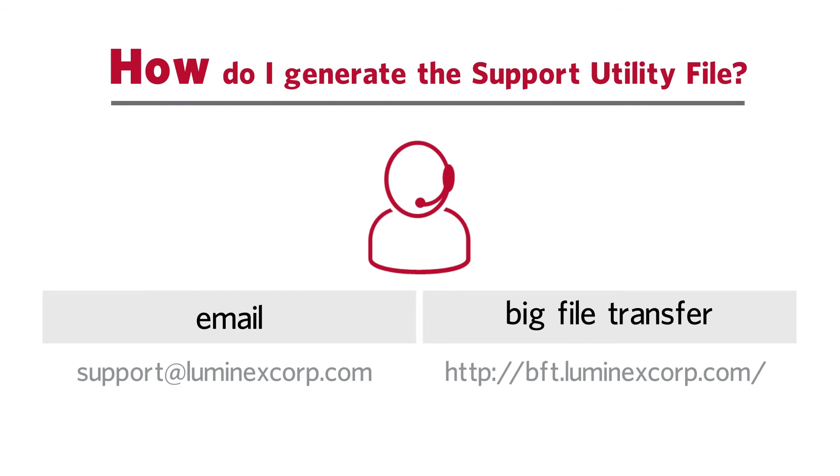Equipped with the support utility file, Luminex Technical Support should be able to quickly evaluate and troubleshoot the error to get your Luminex XMAP instrument up and running again.